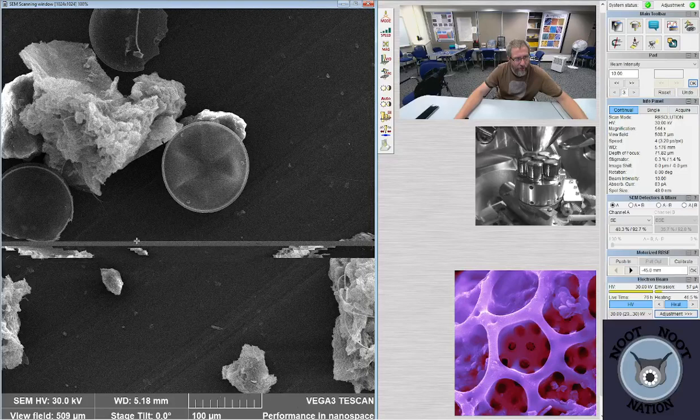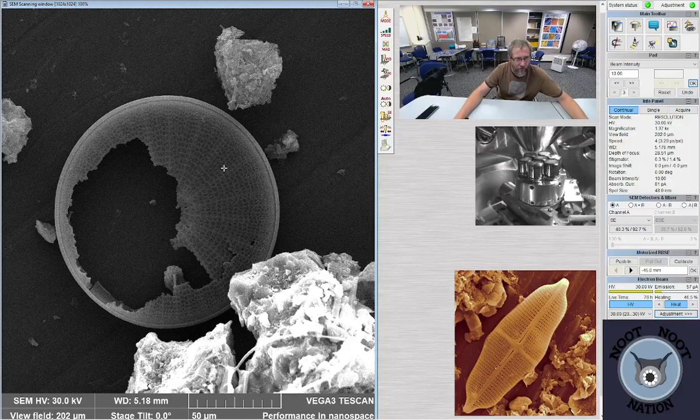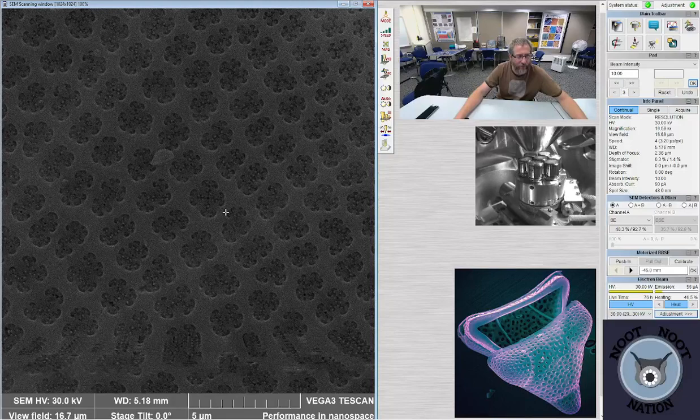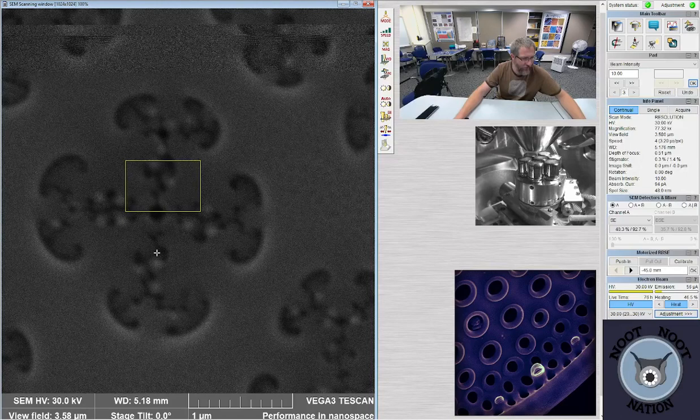And there's another Arachnodiscus right there. And that one's broken. That's an external view. Get up and look really closely at some of the structure, though. I think we can still do that even though we've got a broken one. This is the outside of those weird-looking X-shaped pores that we were seeing. So you can get a good sense of how it looks from the outside.